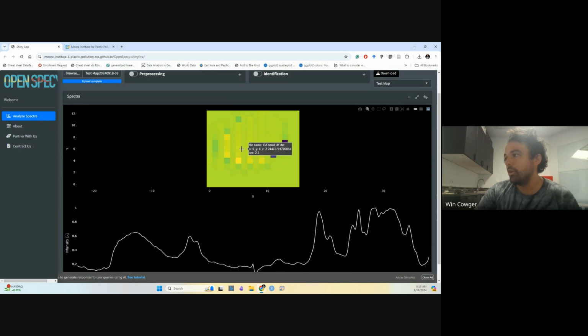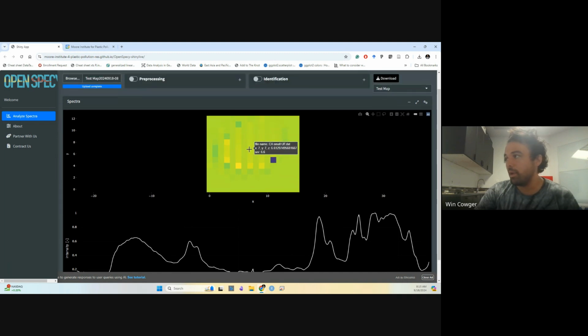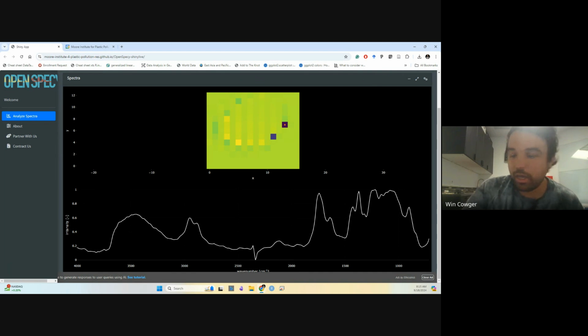darker colors here. The signal to noise ratio for hyperspectral images may or may not be super helpful for exploring the hyperspectral image. There's another format that we'll explore here in a little bit, but just to give you some intuition about these.